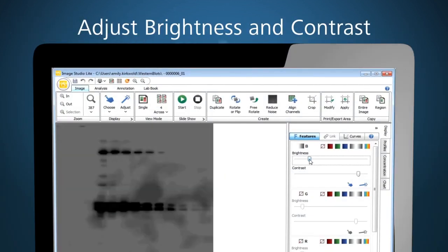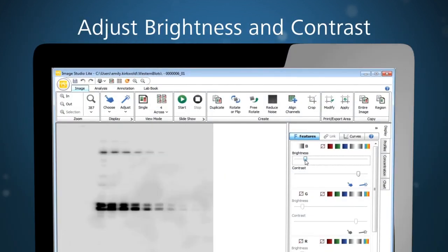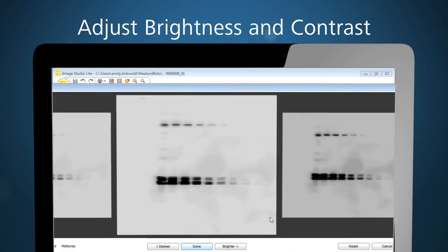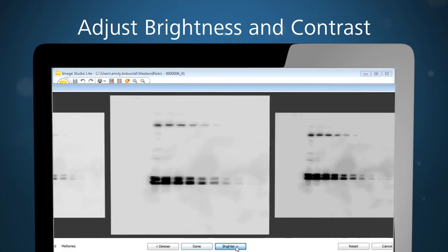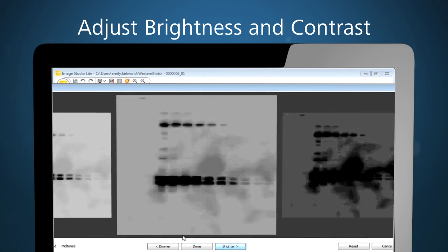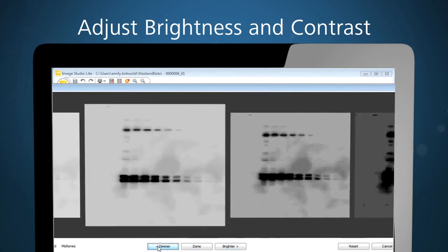You can even change the visual appearance of an image so that the relevant information is visible on your screen. The best part is that this does not change the data collected for that image or the quantification of that data.